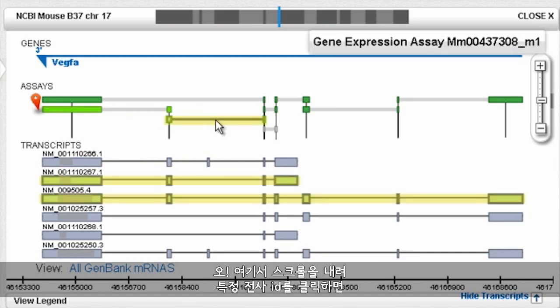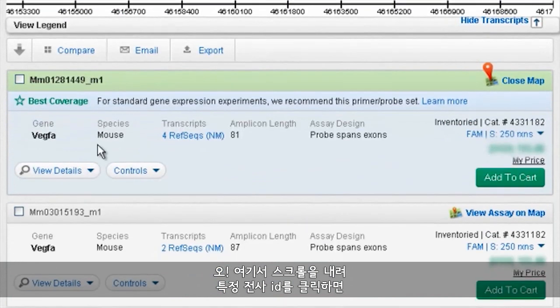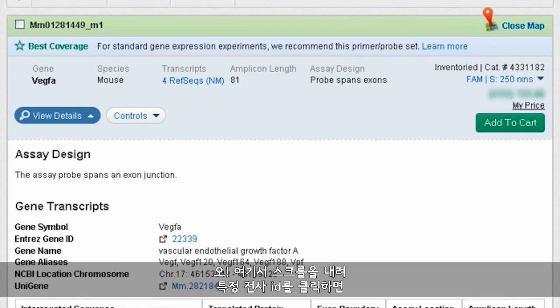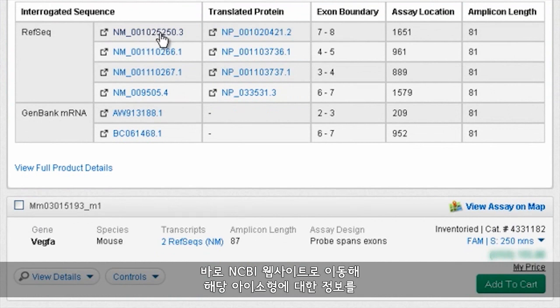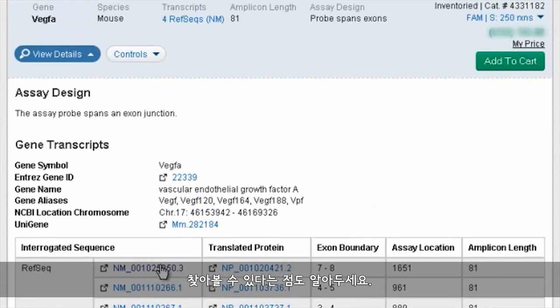Note that by scrolling down to this list and clicking on a specific transcript ID, we can go directly to NCBI's website and get more information on that particular isoform.